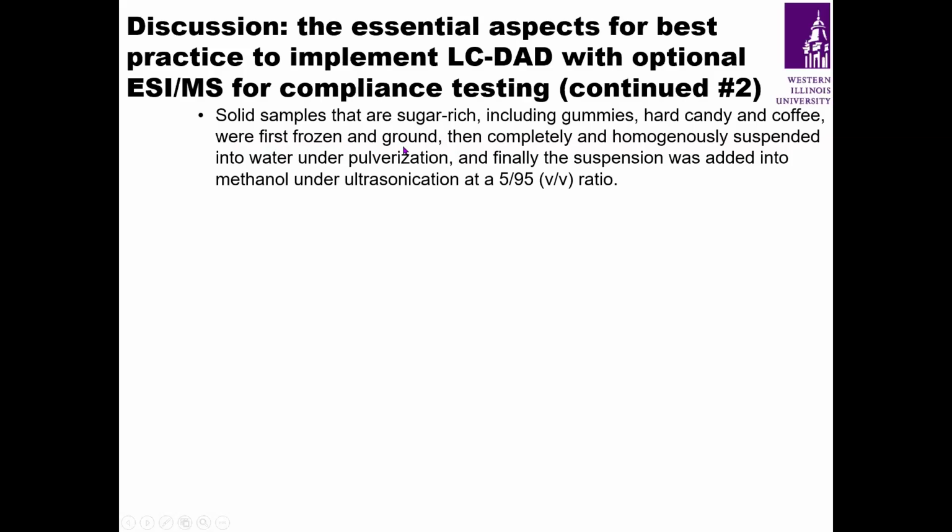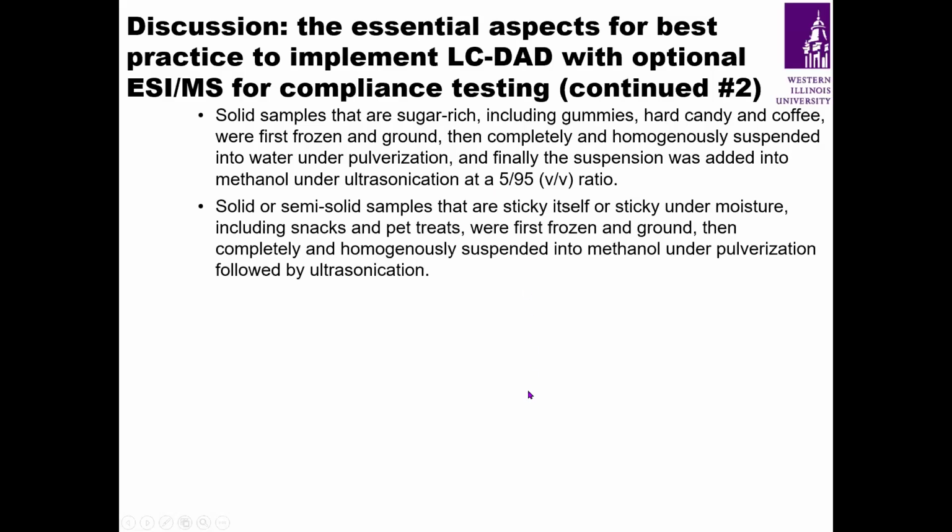They were first frozen and ground, then completely and homogeneously suspended into water under pulverization because sugars don't dissolve in methanol. And finally, the suspension was added into methanol under ultrasonication at a 5 to 95 volume ratio.